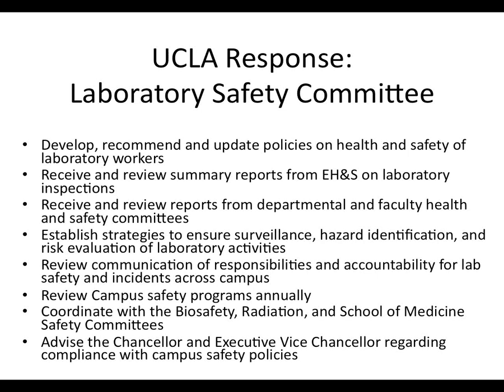Receive and review reports from departmental and faculty health and safety committees. We have those. Establish strategies to ensure surveillance, hazard identification, and risk evaluation of lab activities. Review communication of responsibilities and accountability for lab safety and incidents across campus. We review the campus safety programs annually. And we coordinate with biosafety, radiation safety, and the School of Medicine safety committees. So the Lab Safety Committee, really, its main focus is on chemical safety. But we also have biosafety and radiation safety committees, so we coordinate with those other committees. And the Lab Safety Committee advises the Chancellor and the Executive Vice Chancellor regarding compliance with campus safety policies.